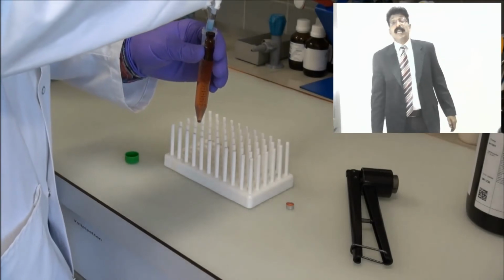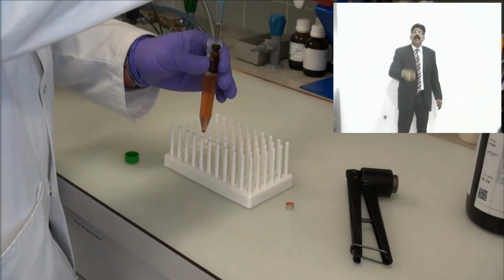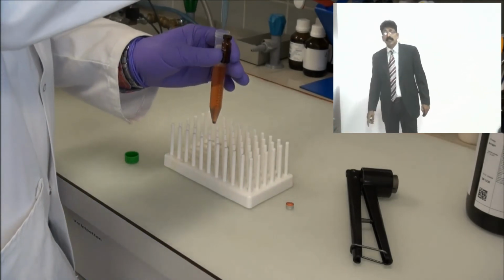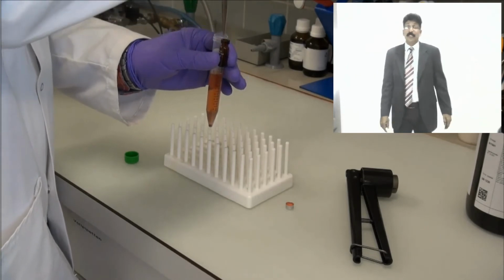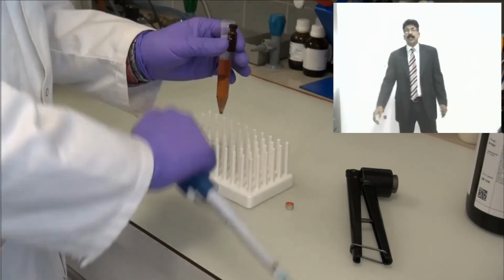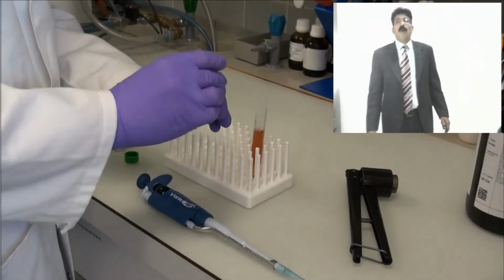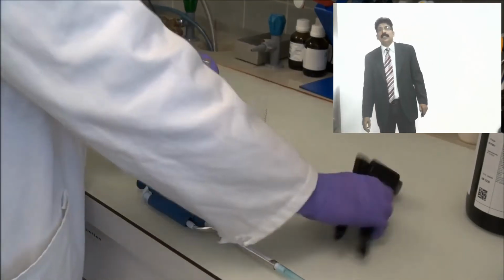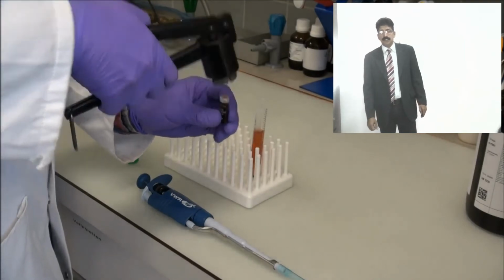It will be sealed, and it is very interesting to see how she is sealing the sample. For standards, everything you have to label properly, because every day you will be doing many different samples. So she is pouring it into the vial, sealing it with an aluminium cap, and keeping it ready for sampling to the HPTLC instrument.